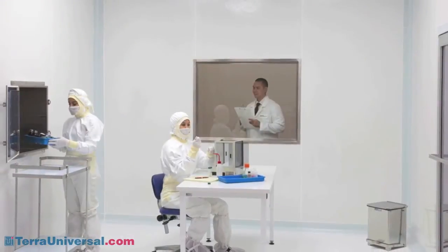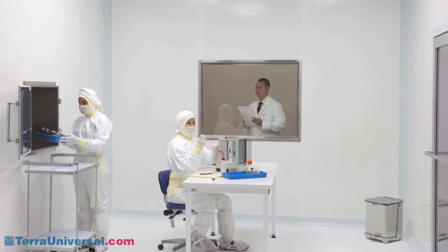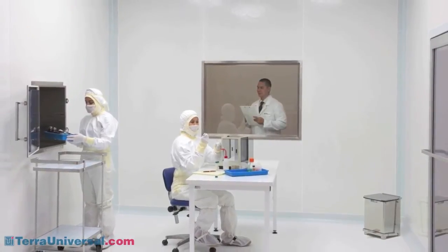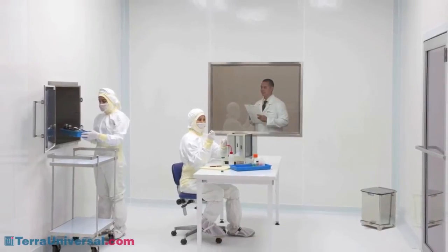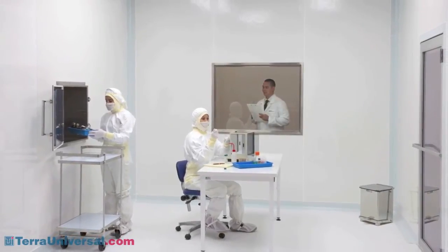In a modular room, the FRP panels can be installed on gypsum wallboard or existing substrate attached to a steel support frame. For clean room conversion, the existing wall can generally be used.